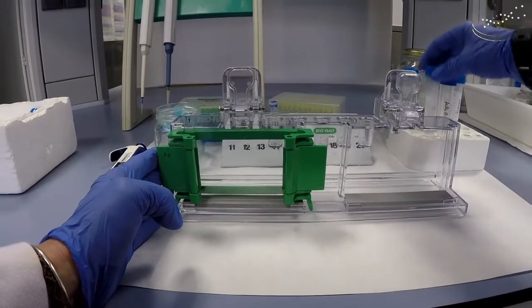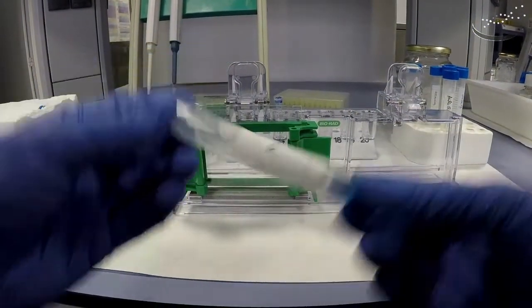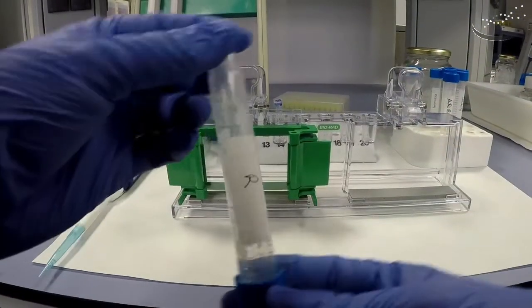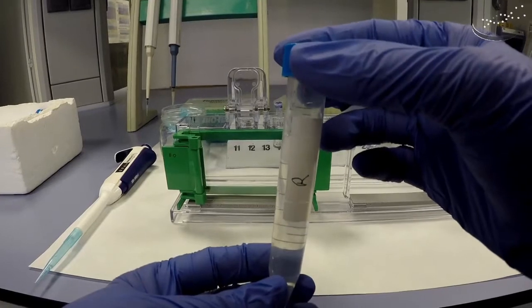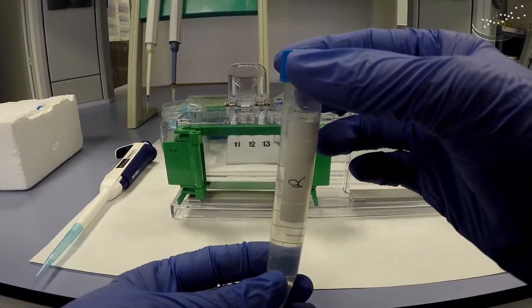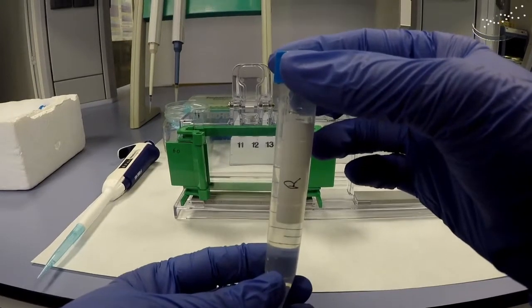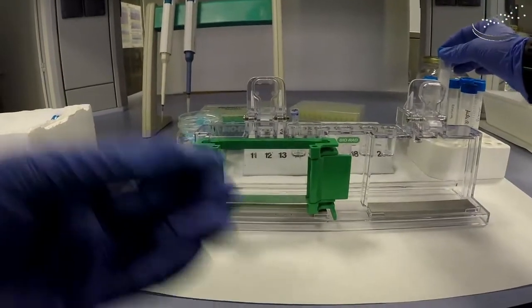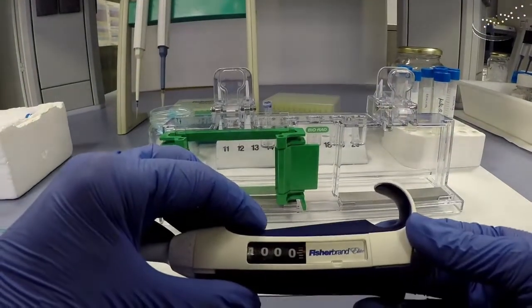In the following video, we're going to show you how to prepare polyacrylamide gels with the Bio-Rad system. Here's the system, and what we have prepared already are the components of the resolving gel with the acrylamide, the water, the glycerol, and the buffer. This is already pre-prepared with everything besides the APS and the TEMED. So the solution is ready to go, and this is what we're going to use.